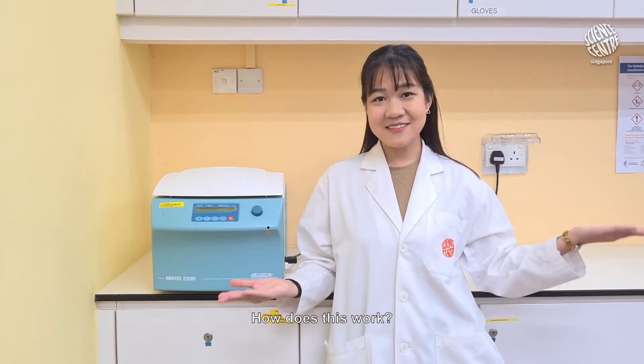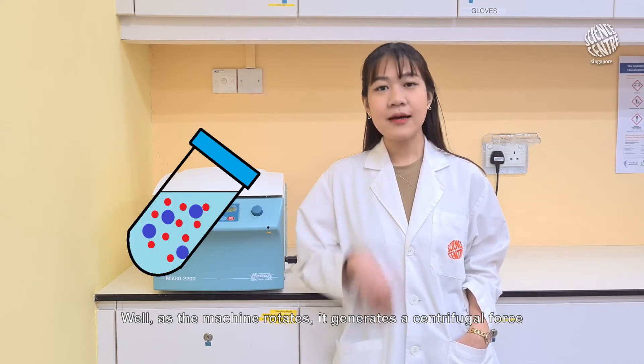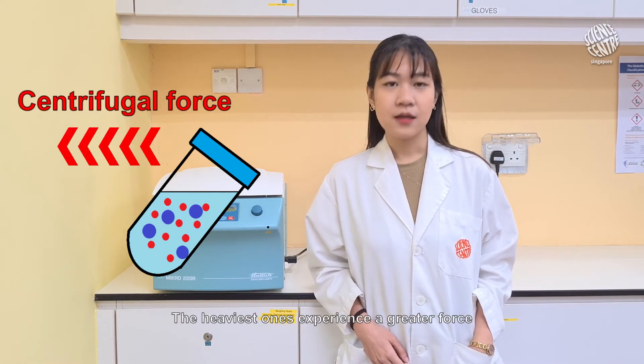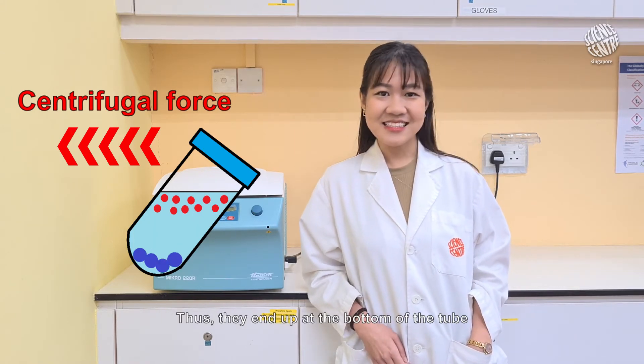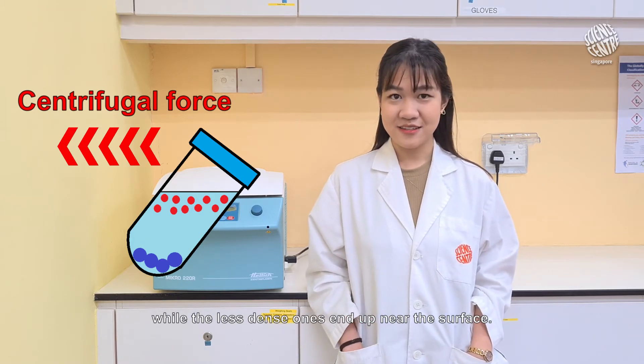How does this work? Notice how the tubes were slanted inwards just now? As the machine rotates, it generates a centrifugal force on the particles in the mixture. The heavier ones experience a greater force, hence they are flung the furthest away from the centre. Thus, they end up at the bottom of the tube while the less dense ones end up near the surface.